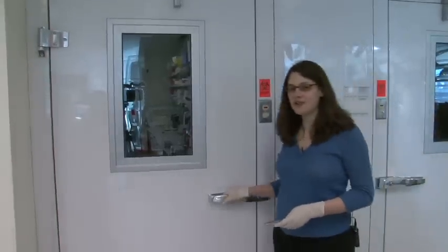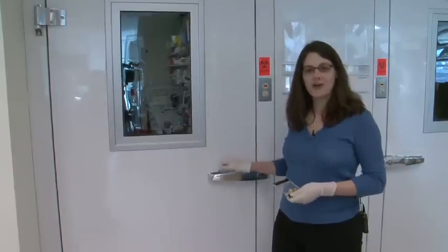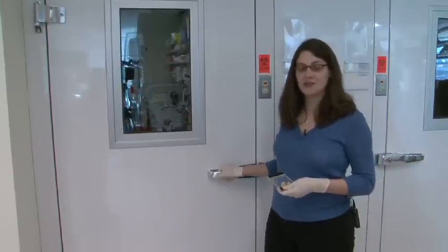So here we are at the darkroom. This is where we're going to visualize the gel. I've got my gel here, and we're going to go in and shine a certain wavelength of light on it so we can see the DNA.